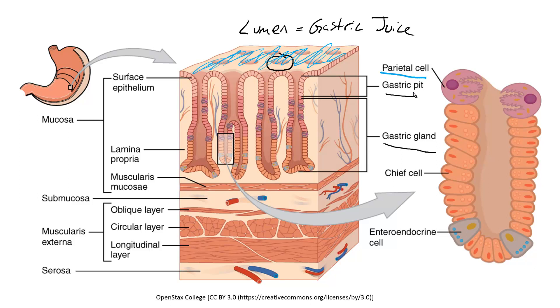As we move down into the gastric glands, the first cell type is the parietal cell. These cells are very large, they tend to stain red in standard histological preparations, and these are the cells that produce both the hydrochloric acid and a substance called intrinsic factor, which is necessary for the absorption of vitamin B12.